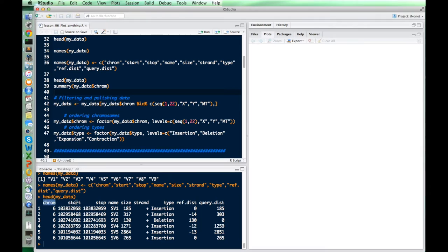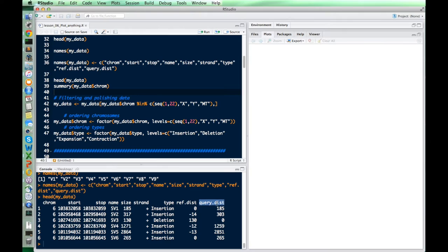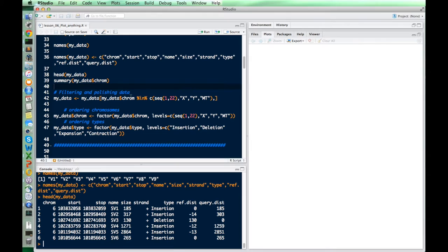We have chromosomes, start and stop positions in the genome, a name, sizes which are useful for distributions, strand, and different types which are useful for categorizing variants. There's also reference distance and query distance — the reference distance is the distance between two alignments in the reference, versus the query distance, which is the distance between those same alignments in the query. We're just going to use this data set to show the different kinds of plots we can make.